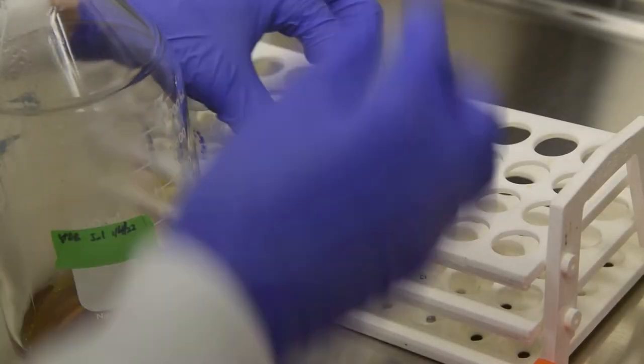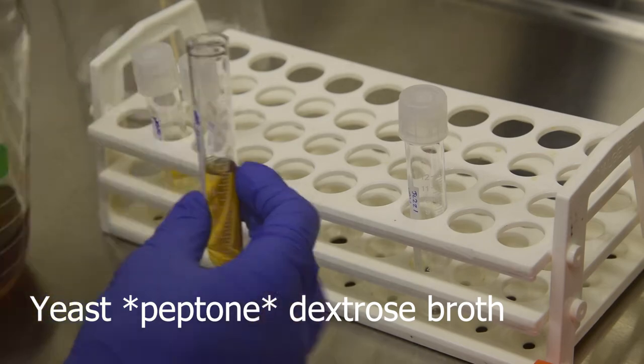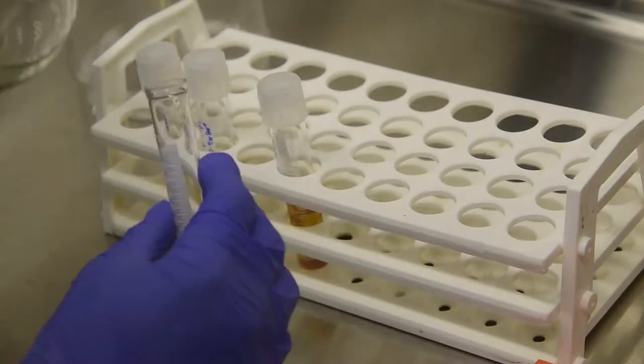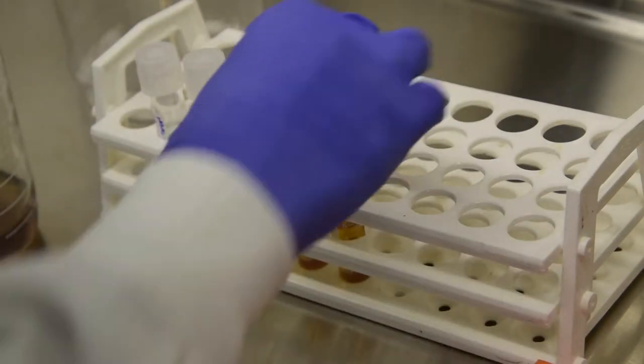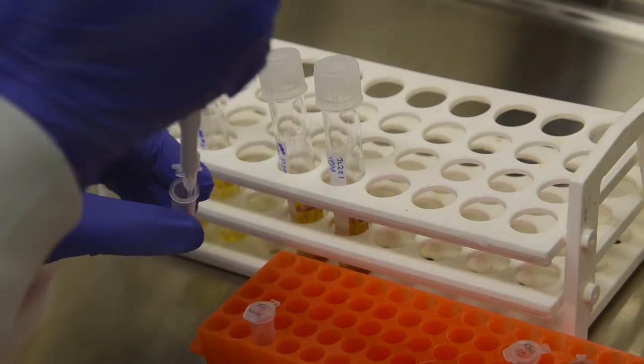The yeasts are grown in yeast peptone dextrose broth, which contains 1% yeast extract and 2% each of peptone and dextrose. You can add yeast cells suspended in water, like I am doing here, or pick colonies from a plate as with the agro.